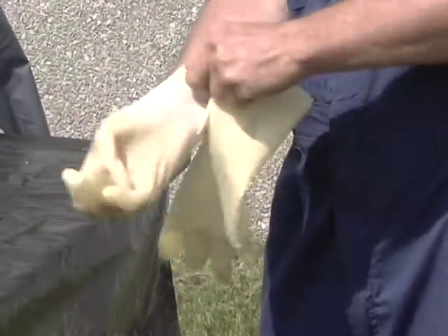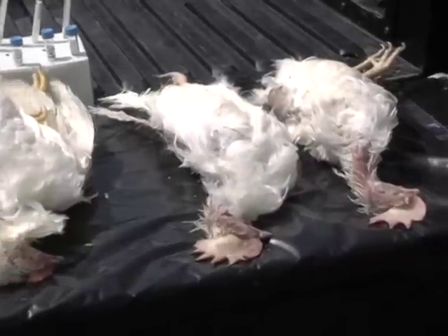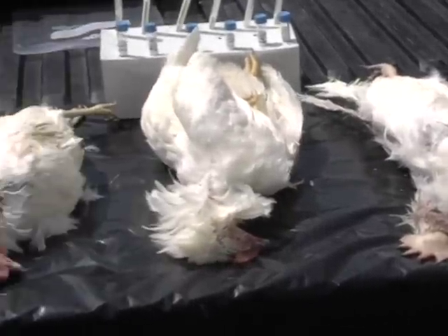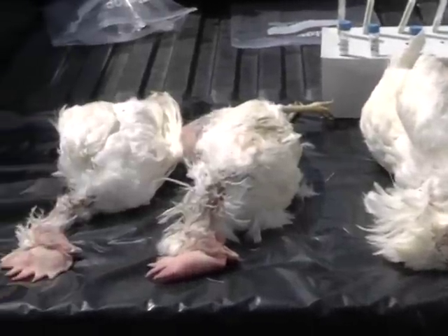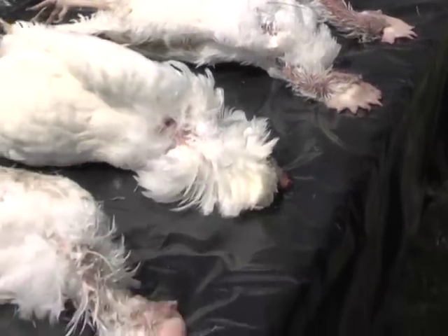Put on gloves and other personal protective equipment. Take five fresh mortalities collected from one house and lay them on the clean workspace. Each dead chicken should be on its side, with the head toward the rear of the pickup.